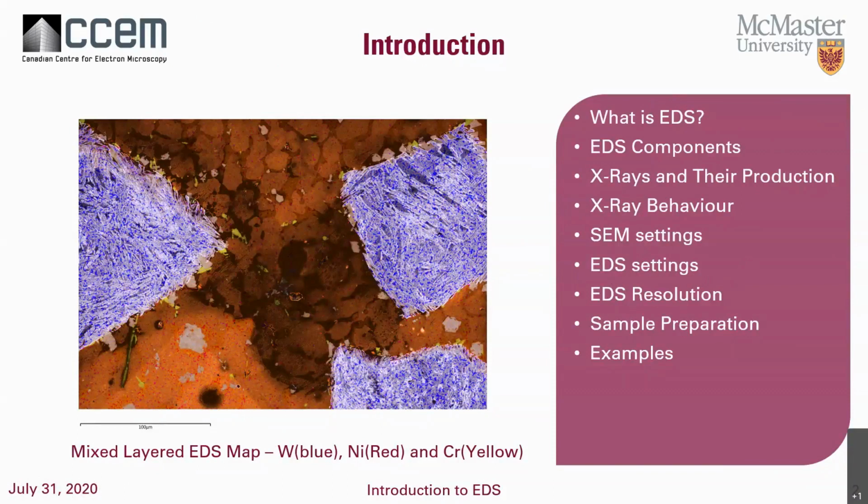We're going to talk about the SEM settings that we use for doing EDS, and within the EDS system itself, what settings we use in the software in order to get the results that we want. We'll also talk about EDS resolution, some things about sample preparation, and I'll give a few examples. I'll try to leave enough time that we can get in plenty of questions if needed.